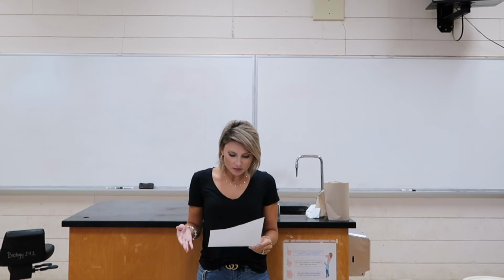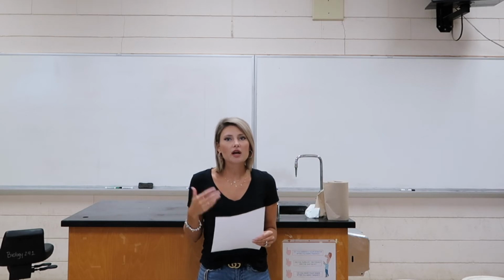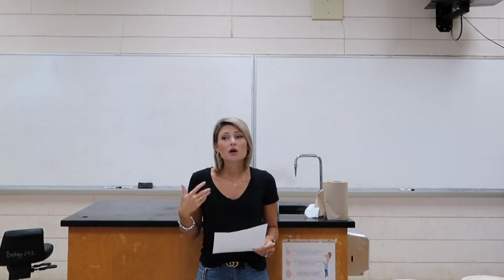20, do you understand the rights to the microscope and other equipment can be revoked if you're not using them properly? Okay, so the microscopes are very expensive. All the stuff that we use in this lab is relatively expensive. So if you're not using it the way that I tell you to use it, and your instructor sees that you're purposely using it incorrectly, they can revoke your privileges. If that happens, you're probably not going to pass the lab, okay, because you have to use the microscope to do your procedures. So please make sure that you follow all directions that your instructor tells you, how to use the microscopes, how to clean the microscopes, because we want the microscopes to last. They're new, so we want to keep them nice.